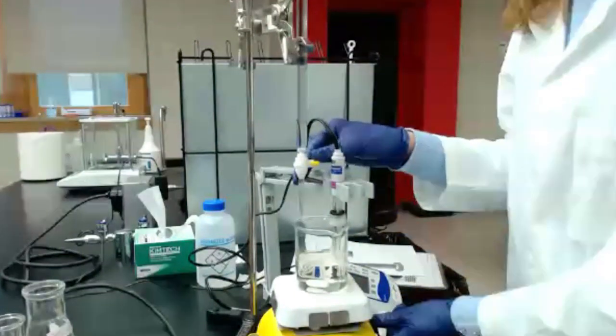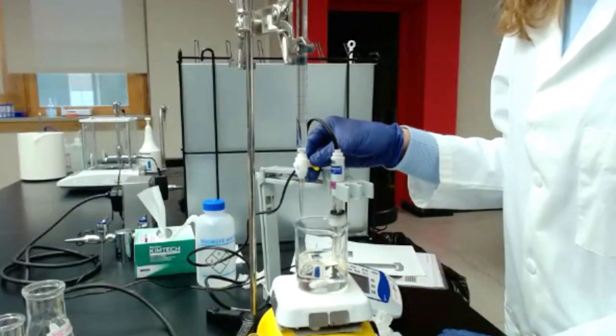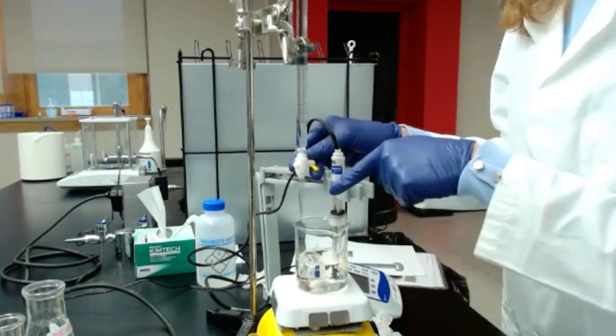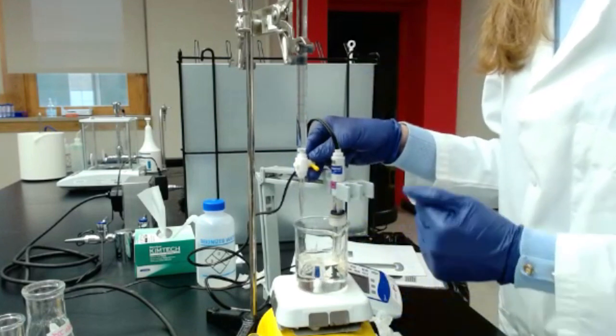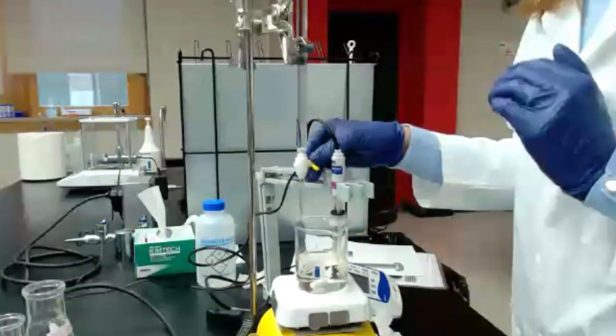So make sure you keep an eye on the pH meter all the time. Make sure it's under stirring and open the tap gently, so it goes drop by drop. Don't go too fast with the tap. If you have a splash of sodium hydroxide, you might be way over the pH of 8.2 too fast.